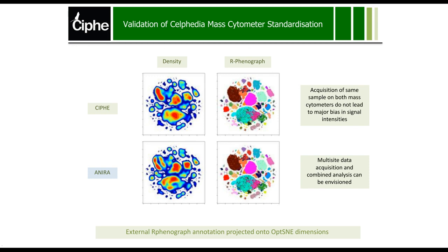So we projected Hervé clustering results onto a t-SNE map. Actually, it's an opt-SNE map. So something you cannot do now on Cytobank, but you can use the visualization techniques that are embedded in it and that are very efficient.